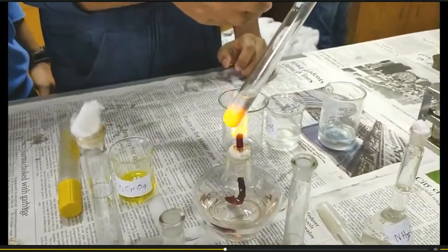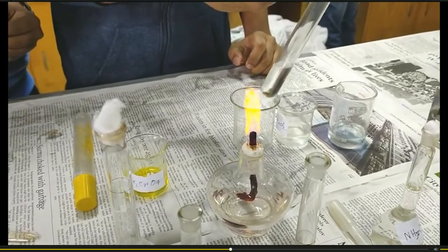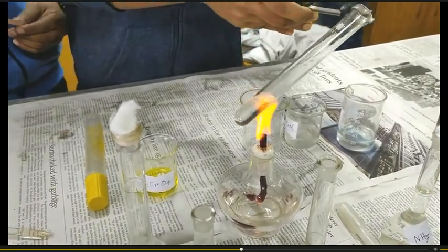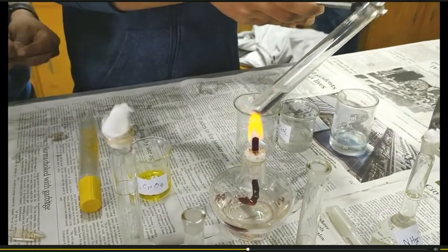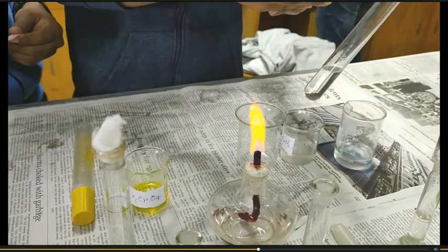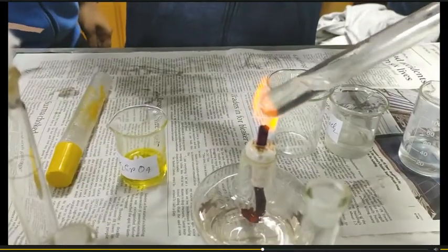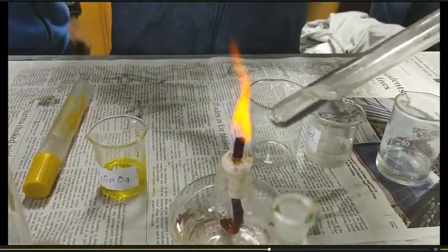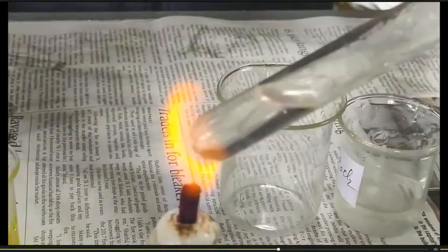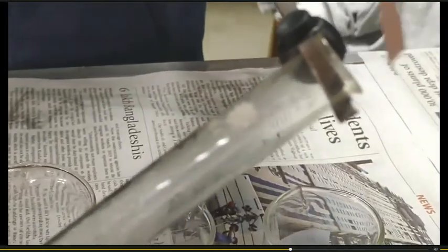When the gas evolves, this gas will turn red litmus paper blue. After heating, when the gas evolves, it has an ammoniacal smell, and it will turn red litmus paper blue.